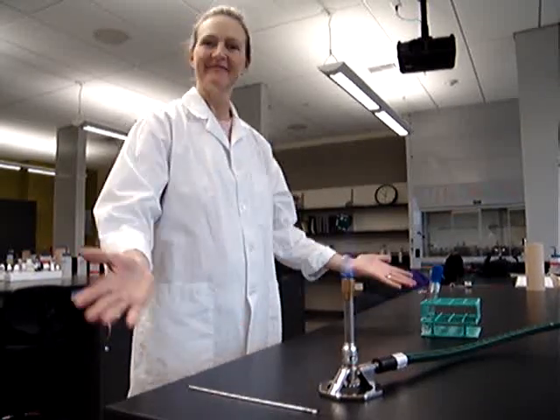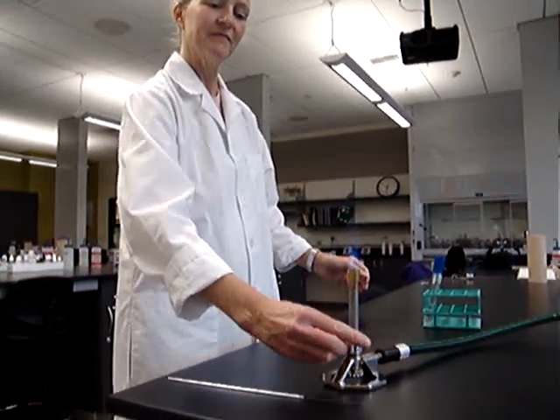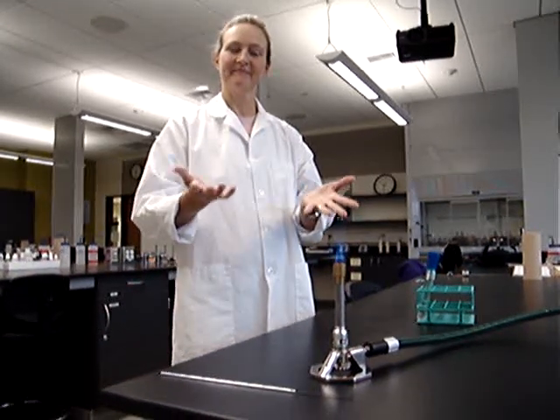Kerti has gone ahead and disinfected her work surface, arranged the materials she needs for safety, and she has her lab coat on, her hands are washed, and her hair is pulled back.